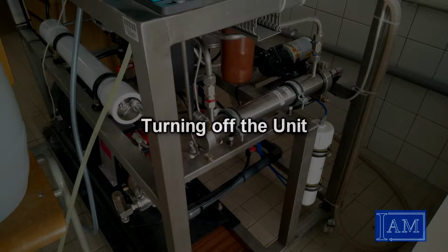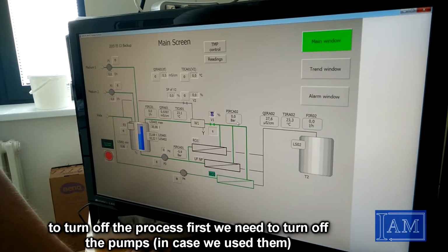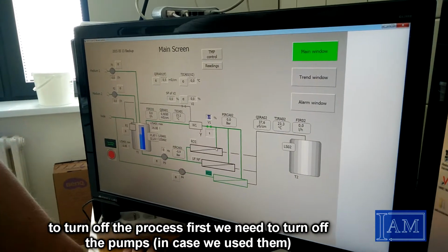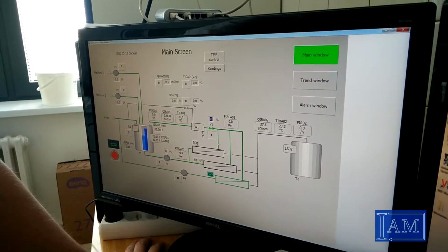Turning off the unit. To turn off the process, first we need to turn off the pumps, in case we use them. Next we turn off the valves, starting with valve V1.